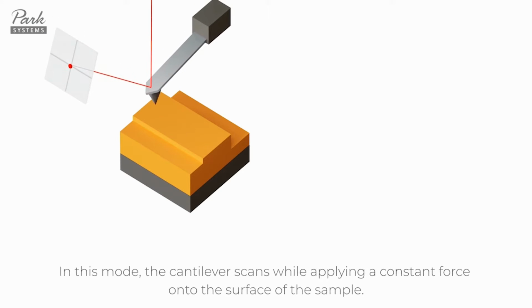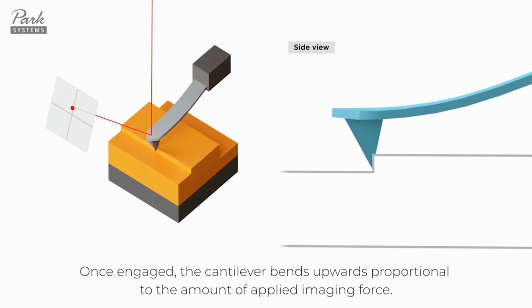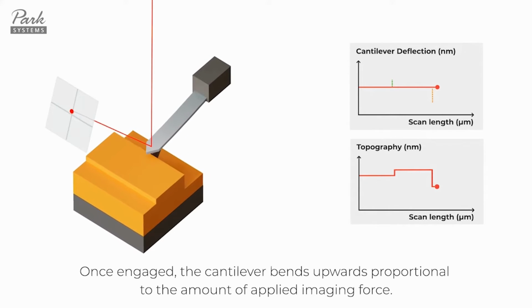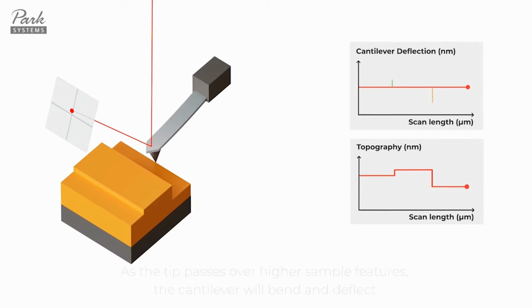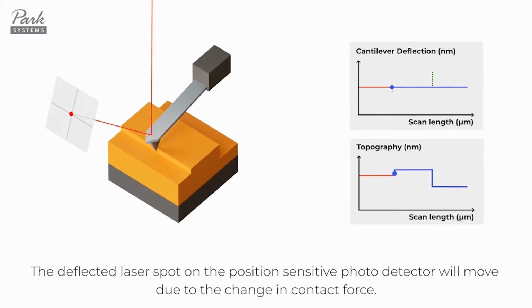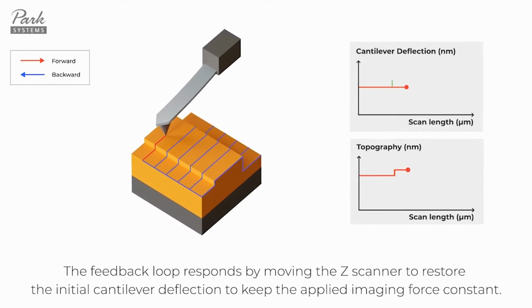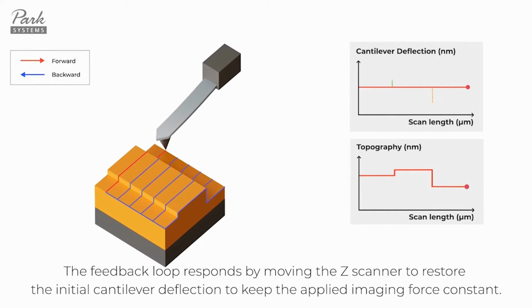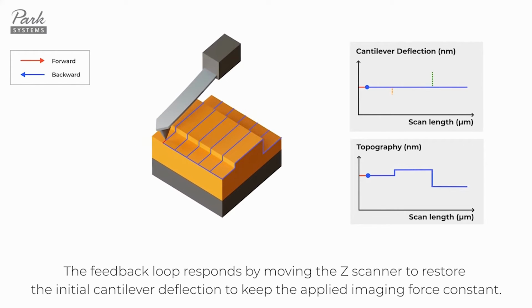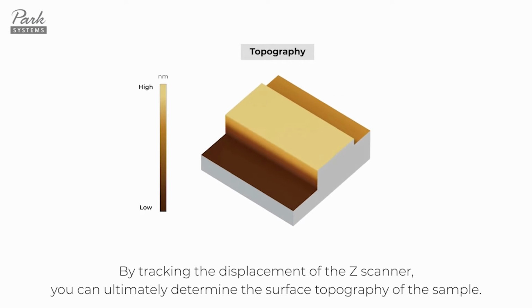And in this mode, our probe is scanning through our material surface while maintaining a constant force between the probe and our material. And in this way, our probe will move up and down with respect to our material surface. And with each of its movements, we keep track of its movement. For example, here we're doing this by applying a laser beam or anything. So this way we can plot our material surface, and then we would generate a 3D shaped image of our material surface. As you can see, the topography of our surface is known after picturing it through AFM.